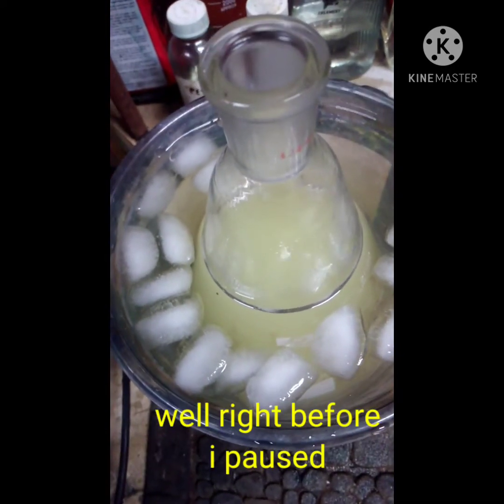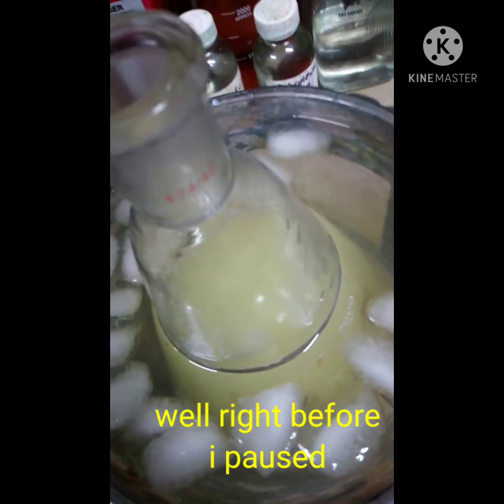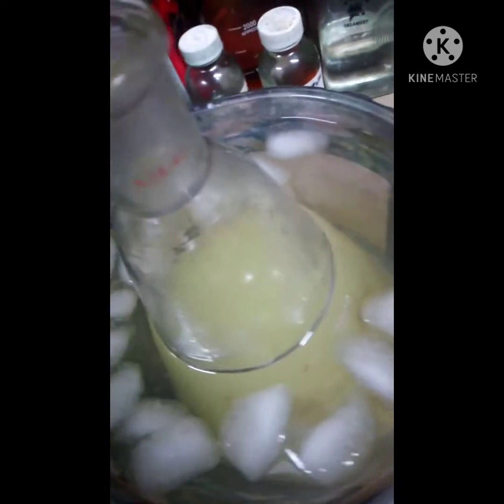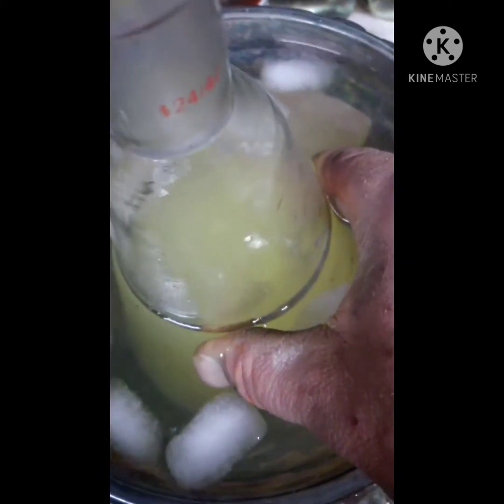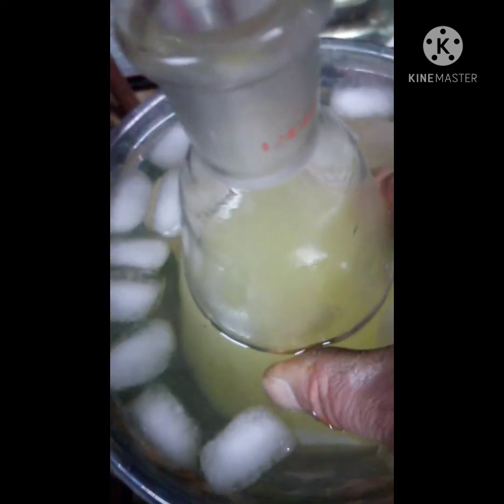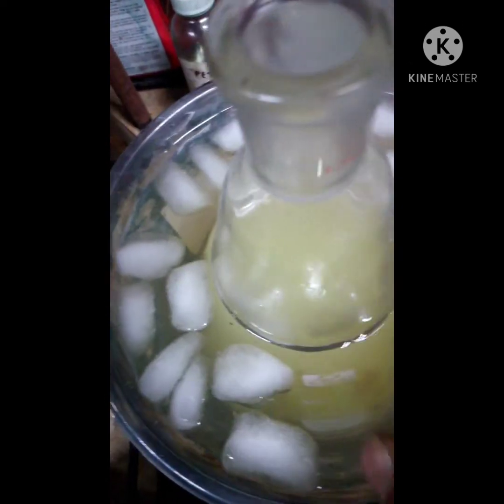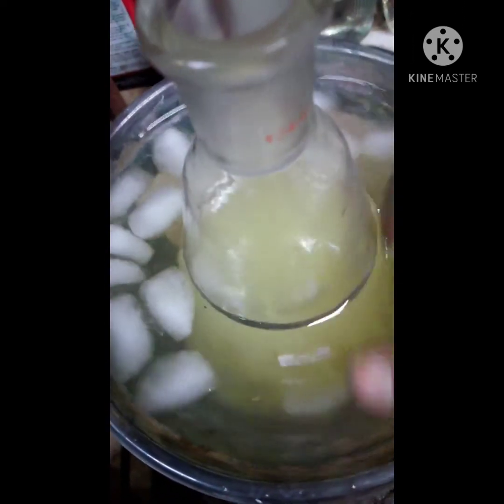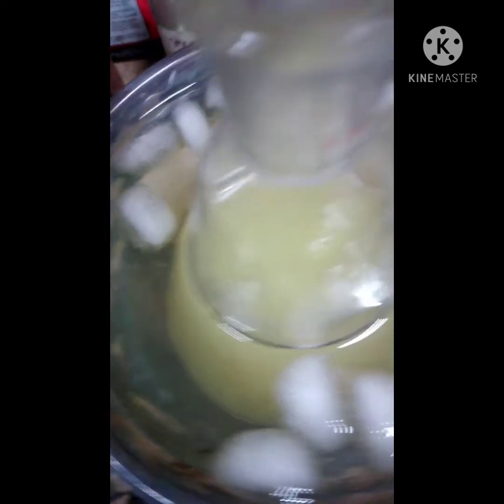Right as I paused, the color change happened - that was exactly what I wanted to catch. But you can see how it's gone its color now, and this is going to start getting pretty warm. I can feel it through the ice water. Now I can pretty much turn the stirring off and just keep this outer water cool until it cools down.